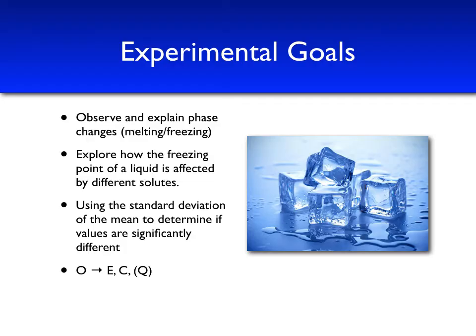To do this, we will use the standard deviation of the mean to determine if values, namely the freezing points of different solutions, are significantly different. Finally, this lab makes use of thinking and understanding skill number 3. Observations lead to explanations, conclusions, and/or questions.